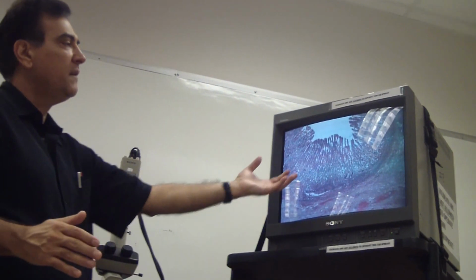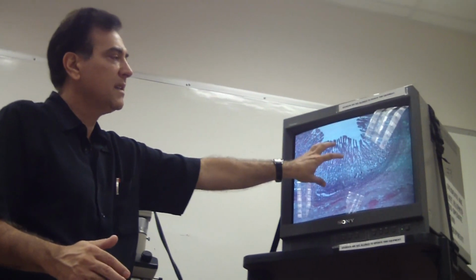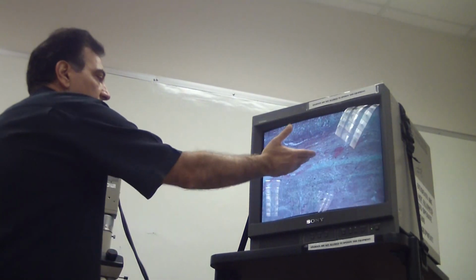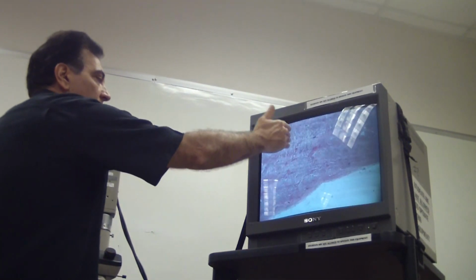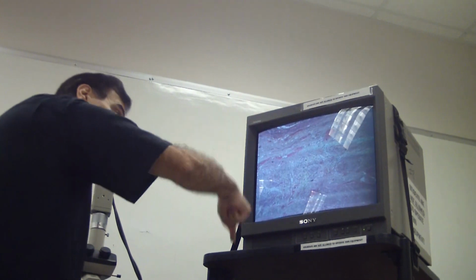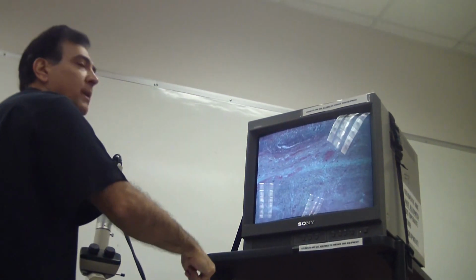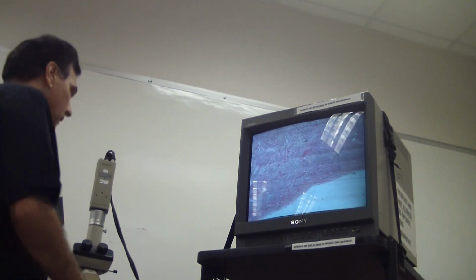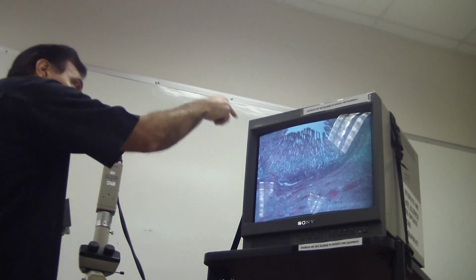So if I say that's the gastric, so that's the stomach right here, then I know this is of course the submucosa, and this is the muscularis what? Externa with, again, since it's the stomach, that would be what? Oblique, circular, and what? Longitudinal. But the first thing you have to establish, that's the stomach.